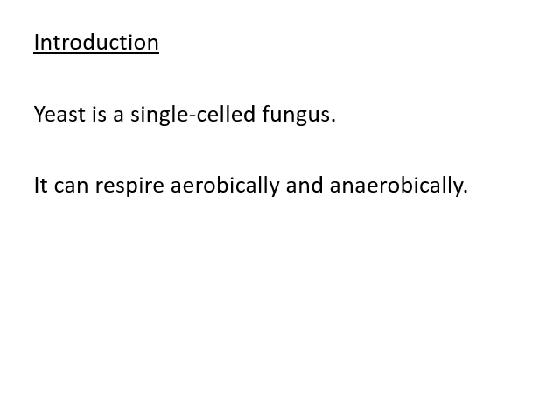So let's talk first of all about yeast. This is the organism that we are going to use in this investigation. So yeast is a single-celled fungus. Okay, so it's eukaryotic cells, and we are familiar with yeast. We have it used in all sorts of food production. So what do we need to know? We need to know that it can respire both aerobically, so using oxygen, and anaerobically.